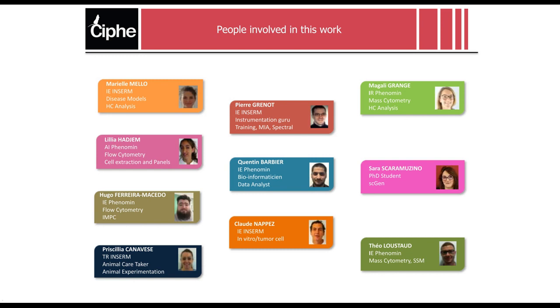We do guide new Cytobank platform adopters through face-to-face trainings, which could be through a teleconference or desktop sharing, but we also advise them to ask for support in parallel, because Beckman has built an application specialist team that can help you go through particular aspects of Cytobank. It's a very rich interface, so you cannot show everything in one webinar, or one face-to-face session.